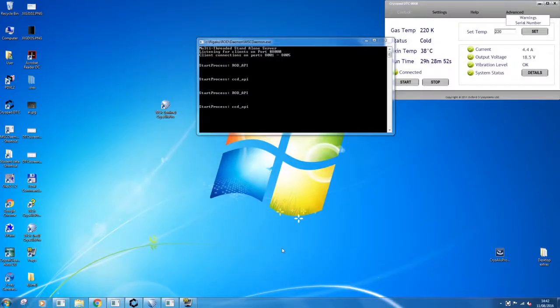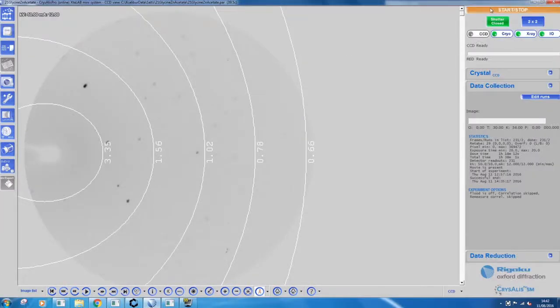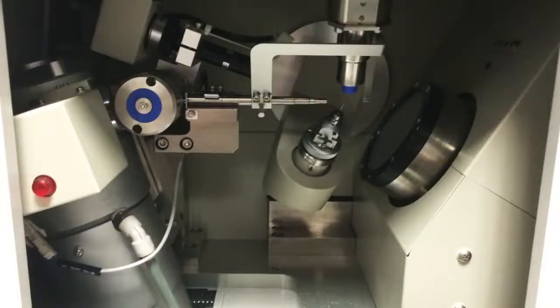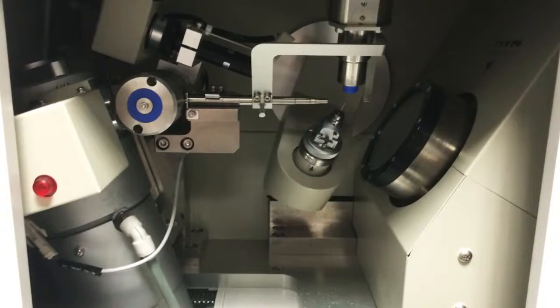The XtalLAB mini instrument is operated through the software program CrysAlis Pro. Open the software on the PC. Before mounting the sample on the instrument, let's point out the various components that make up the Rigaku XtalLAB mini.